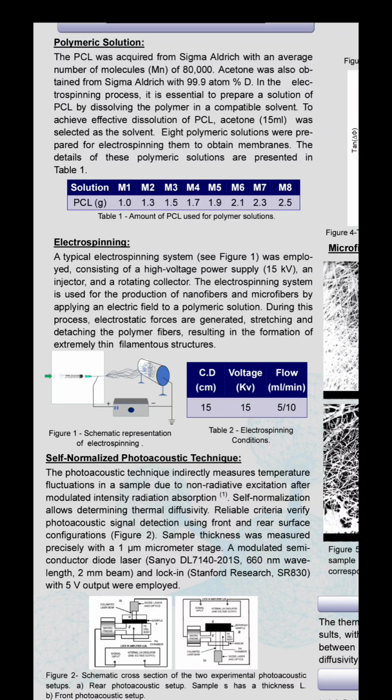Now, delving into the electrospinning technique intended for adhering polycaprolactone membranes, it was ascertained that a voltage of 15 kilovolts proved to be the most fitting for the creation of these membranes. Furthermore, upholding a uniform distance between the needle and the collector was considered vital to obtain membrane fabrication. The detailed aspects of this process are outlined in Table 2. Sorry, in Table 2. Figure 1 shows a systematic representation of the electrospinning system for your consideration.